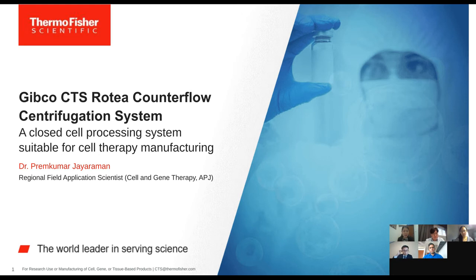Okay, so on our panel we have Dr. Premkumar, we have Ogita-san from Japan, we have Jasmine from Taiwan, and we have Do-Young Kim from Korea. So let me start with the first question for Prem. What are the steps planned to make the Rotea suitable for use in later phase and commercial processes?